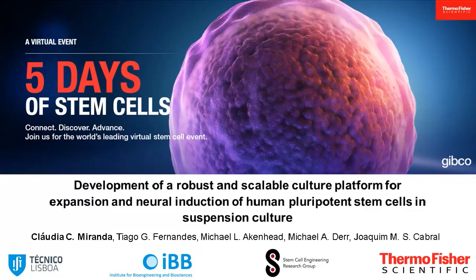Today in our session we are going to talk about how we can develop a robust and scalable culture platform, either for expansion and neural induction of human pluripotent stem cells in suspension culture.